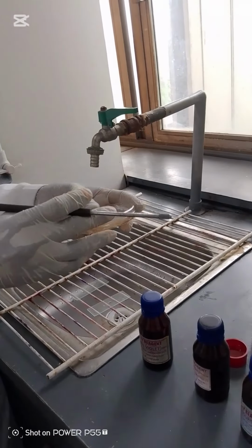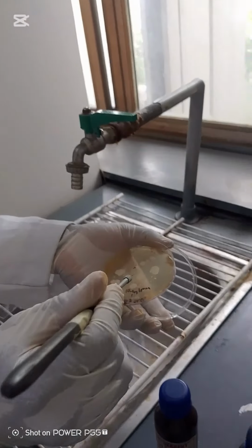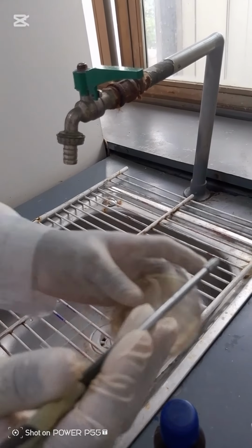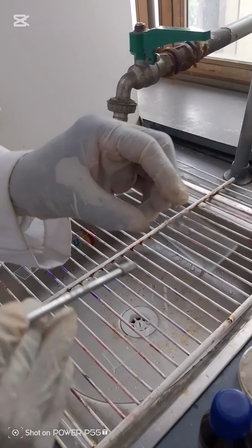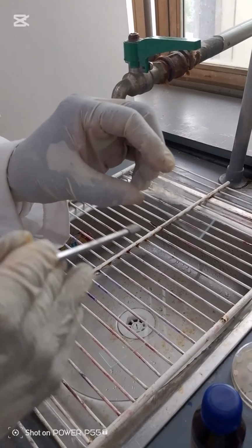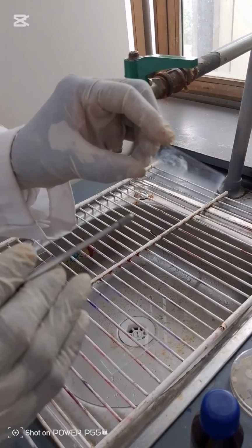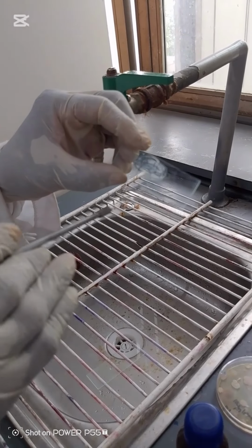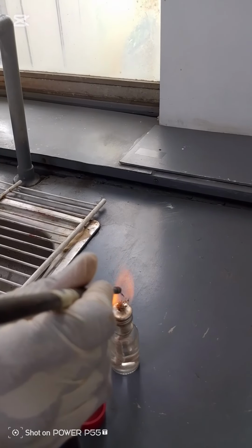This is a bacterial cell. You pick a little aliquot from the bacterial cell. Then you make a smear on the drop of sterile water that you have on the glass slide. You are spreading the bacterial cell so you have an even distribution, so it will not just be congested in one place.